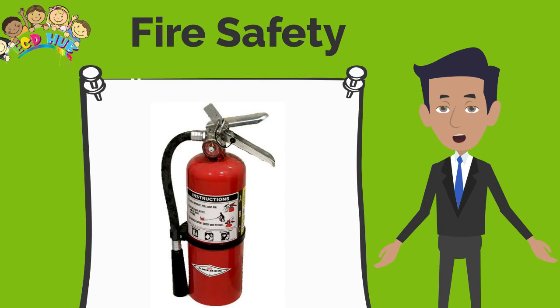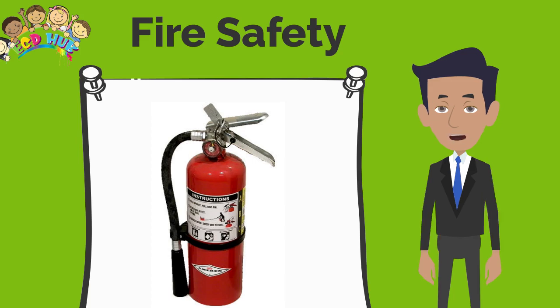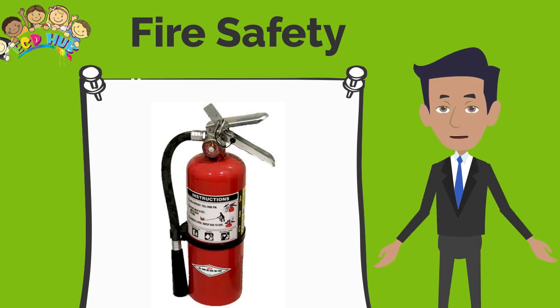In the event that there is a fire during lab, immediately tell the teacher. Walk over to the fire extinguisher, pull out the safety pin, aim the nozzle towards the fire, and push the handle down. Empty out the entire tank.